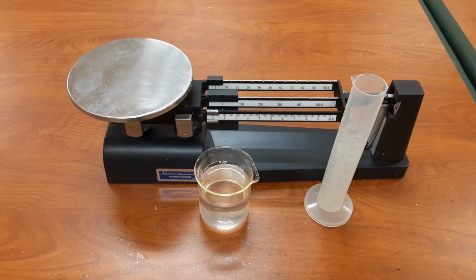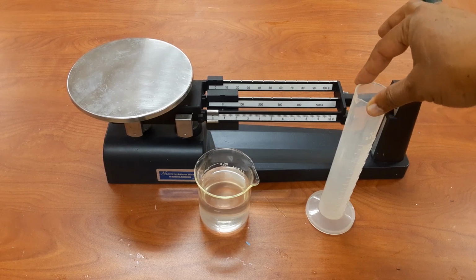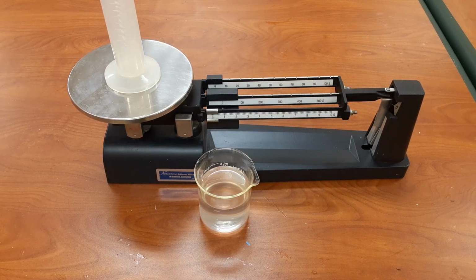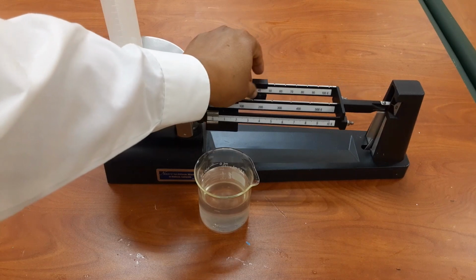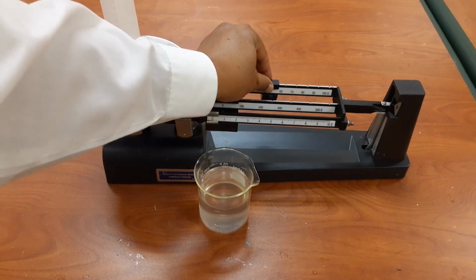In the second part of this lab, you want to find the density of water. So I've got some water here, and I will need a graduated cylinder. So first thing I do is I put the graduated cylinder empty on the triple beam balance, and then I try to figure out the mass of this empty graduated cylinder. So it's less than 60, it's more than 50.